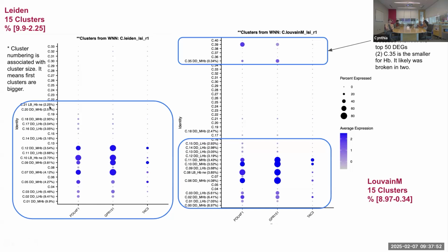And we can also check that there are particular clusters where we don't have a high signal of this. So in cases like this, for example, where we have split it into small clusters, because as we can see, Louvain tends to split the clusters in two. So we have a very small population here that represents less than 1%, that is slightly seen in the Louvain multi-level clustering. So I think that it was split from one of these clusters here.